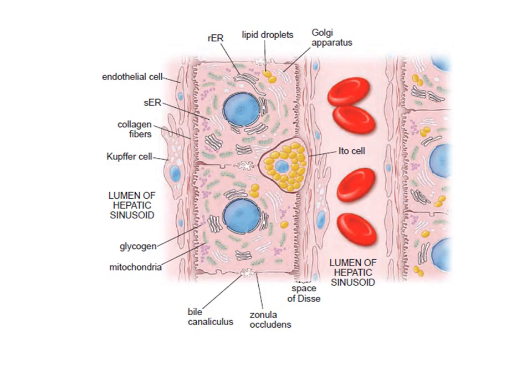Here again, this is the hepatocyte. You can see cells in the perisinusoidal space between the hepatocytes and endothelial cells. This is the perisinusoidal space, and the one containing the RBC is the lumen of the hepatic sinusoid, as you can see clearly here.